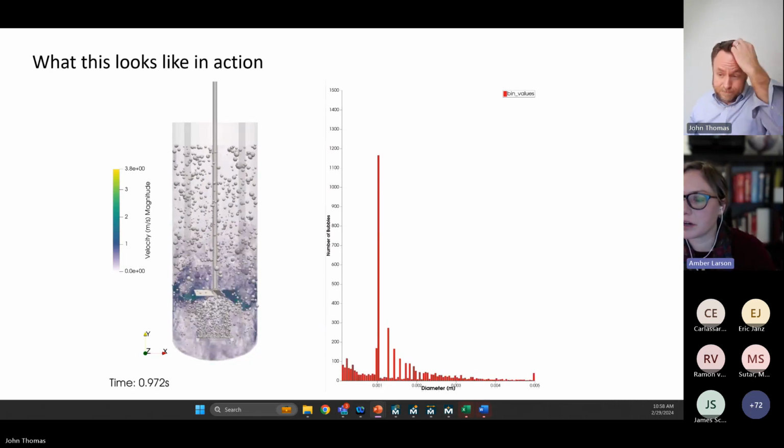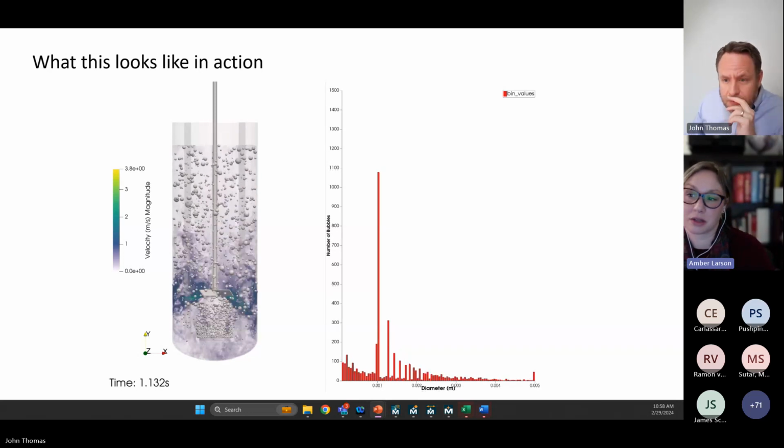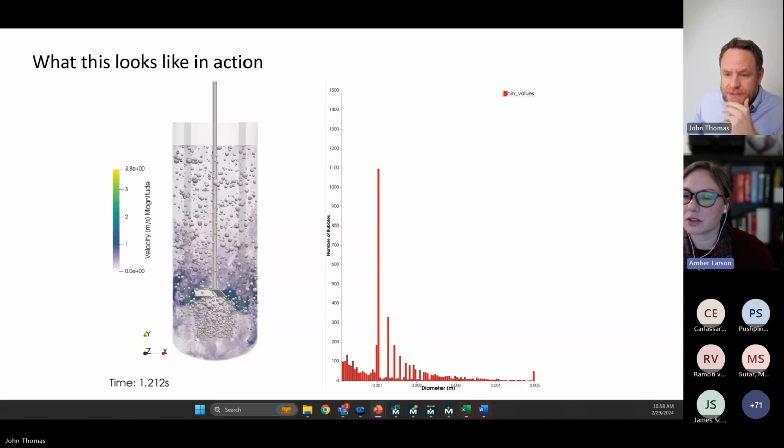Okay, next question. If a parcel evolution delay were to be put into the simulation, potentially tied to the local concentration of parcels, could that help to reproduce the corner bubbles and reduce the overpopulation of large bubbles at the top of the simulation? Great question. The answer is yes. In principle, I have this zero order relaxation time where as soon as a bubble sees a certain EDR, it just collapses down to this new size. In reality, I should have some sort of relaxation time, Dave, that I just don't know how to tune or how to set. So I'm doing a real dumb zeroth order relaxation.